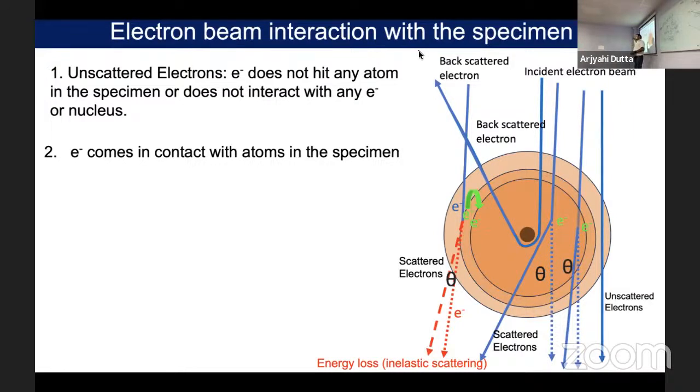You understand? If we just use 400, I don't know. It is like when you have a gun and shoot a glass at high speed, it will just make a small hole and go through. But if it takes a little bit of time to transfer its energy, it may break the entire glass. Sometimes it depends on the ice thickness and also how much electron dose you are using. From our practical experience, if you are using 40 electrons, generally 10 seconds is okay and there will not be too much damage, but still damage will be there. We cannot say damage will not be there.